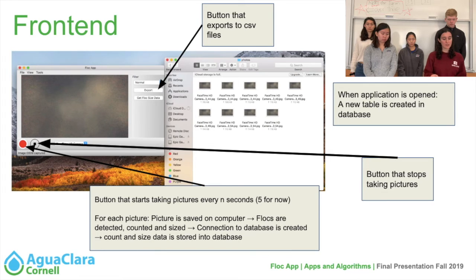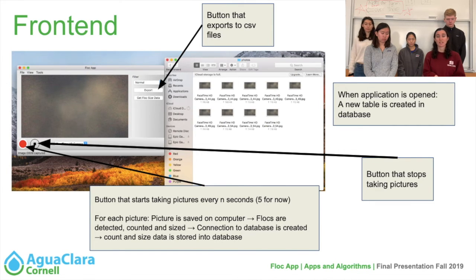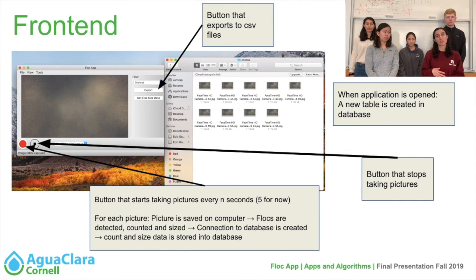Once all of these images are taken and stored, our web application is also determining the size and count of the flocks in the images. Once this count and size is determined, it is stored in an Excel spreadsheet that can be exported, saved, and used in any way by the plant operator. In future semesters, we hope to take all this data and use it to determine if the plant operator should add more or less coagulant and eventually automate this process.